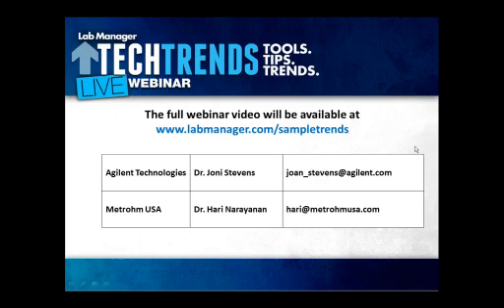This trend is growing, and it is continuing. Personally, I would say that more and more miniaturization technology is coming for sample preparation in combination with the IC. That's what would really benefit the users. Not just miniaturizing the IC, but the miniaturization and the nice tandem connections of the sample preparation together with the IC would really benefit the users' world.